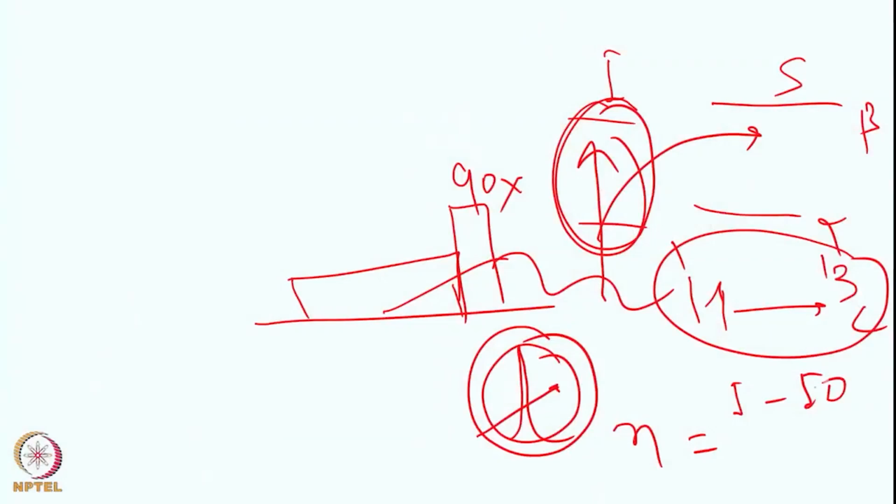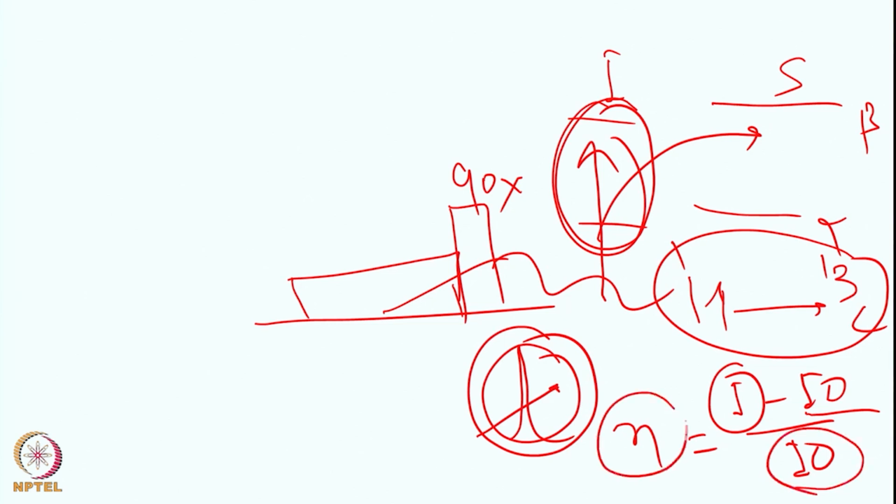The NOE is given by I minus I0 divided by I0. Here I is the saturated spectrum, I0 is the non-saturated spectrum, and the ratio with the non-saturated spectrum gives the enhancement factor, which is the NOE.